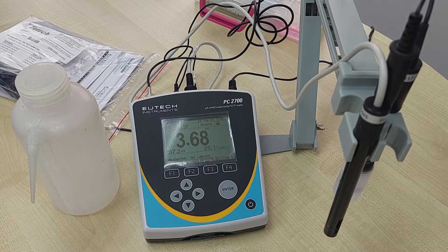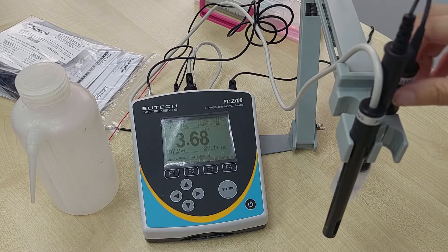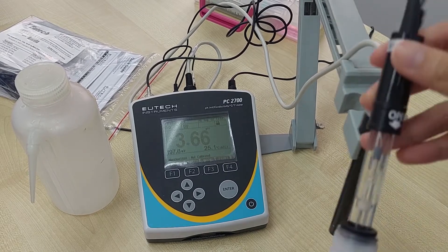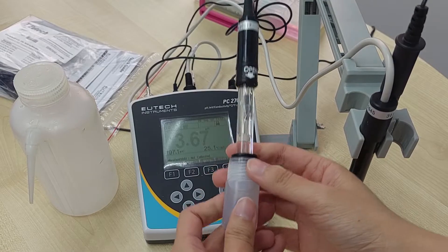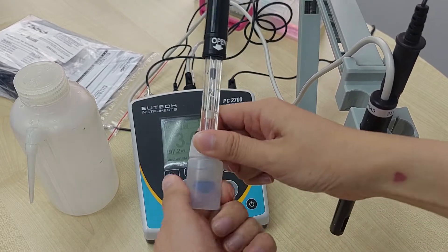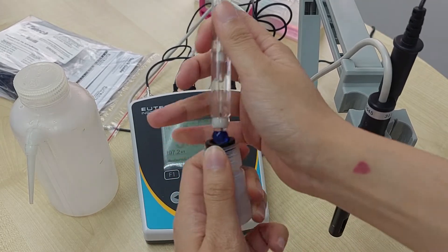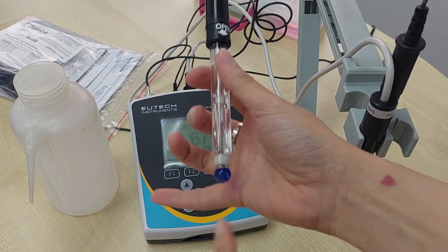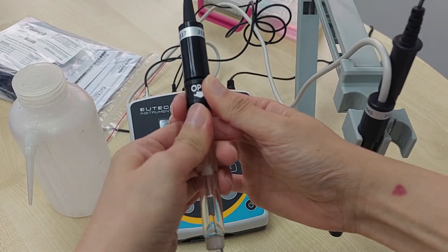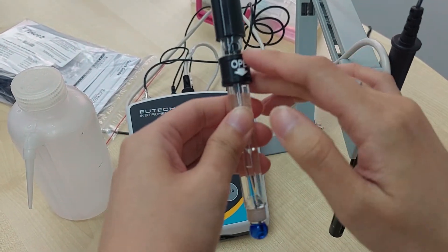We will start with pH first. Every time you start your measurement, you will need to do calibration for the pH probe. This is our glass double junction refillable electrode. To open this, you need to unscrew the bottle first to release the pressure before you remove the probe. You need to be careful because it is made of glass — if you don't handle it properly, it will break.